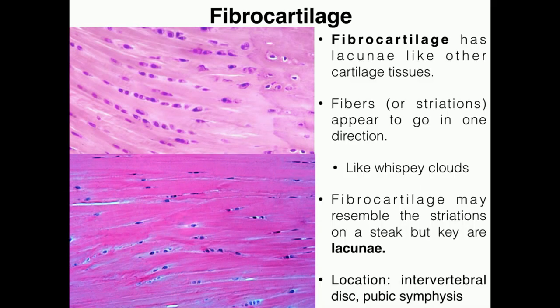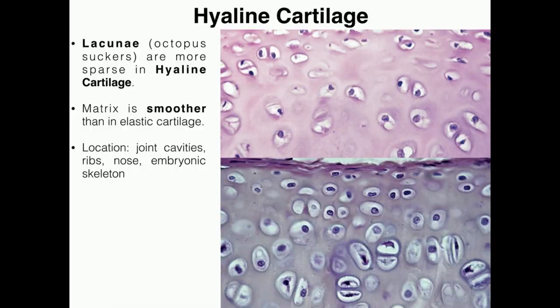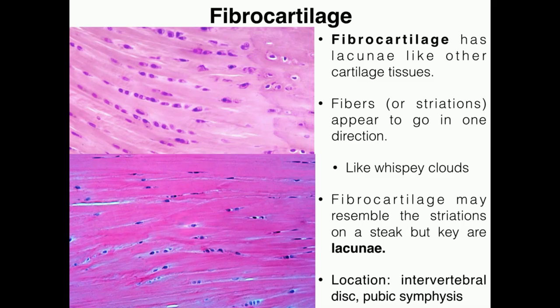The last type of cartilage also has lacunae. They're not as obvious and look a little bit different, but you can still usually tell they're lacunae. Here's an example at the bottom image — you can see a chondrocyte surrounded in a whitish space. All of these things are lacunae. Fibrocartilage's lacunae look a little bit different than they did in hyaline and elastic cartilage.